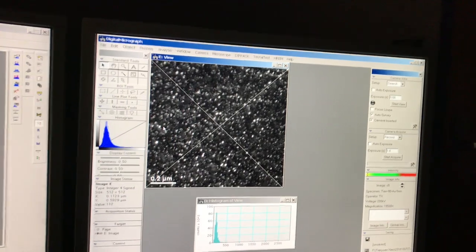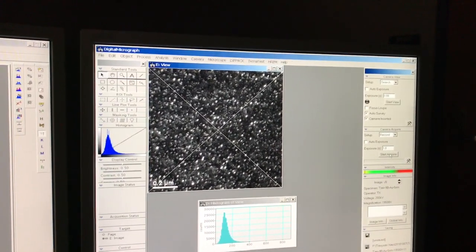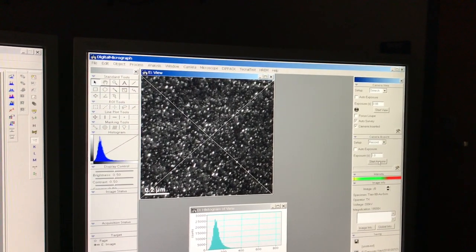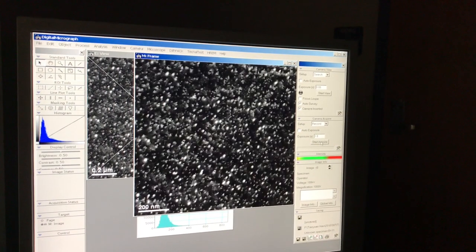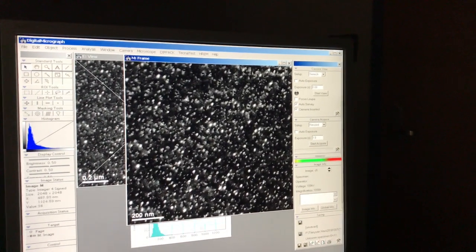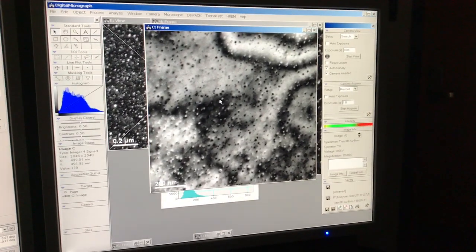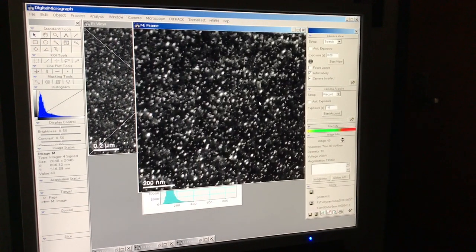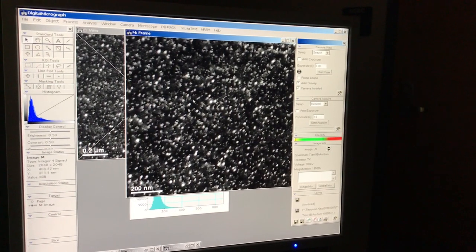Yeah, so it's not too much different there. But you can again see the big difference between centered dark field with S equals 0 and S positive. So if we pull up, all right, that's the dark field with S equals 0, and that's S positive. So we can pick out the faults more readily.